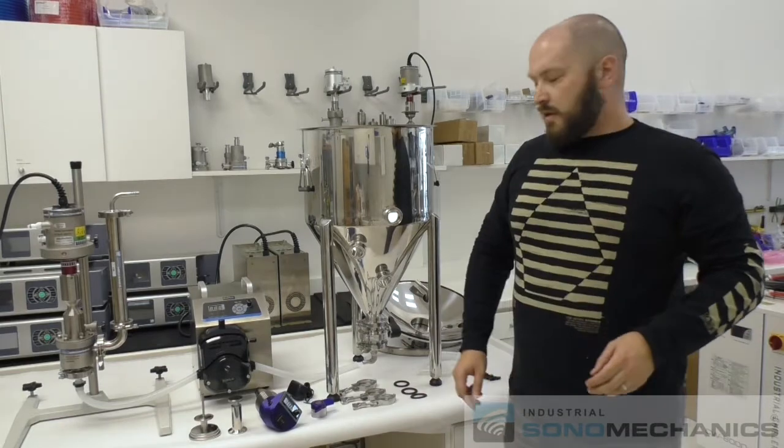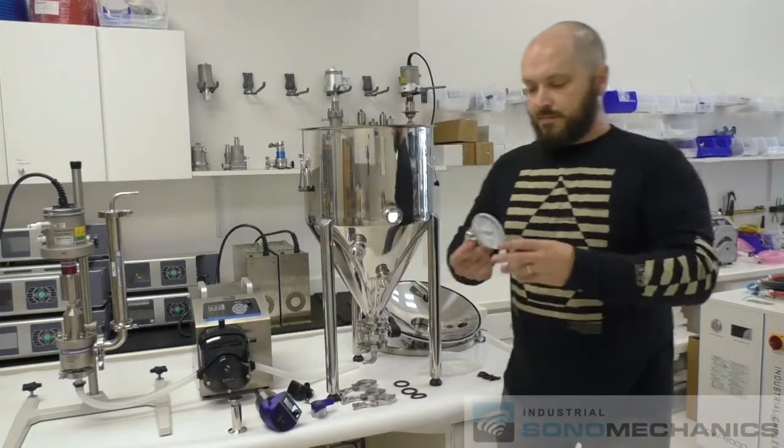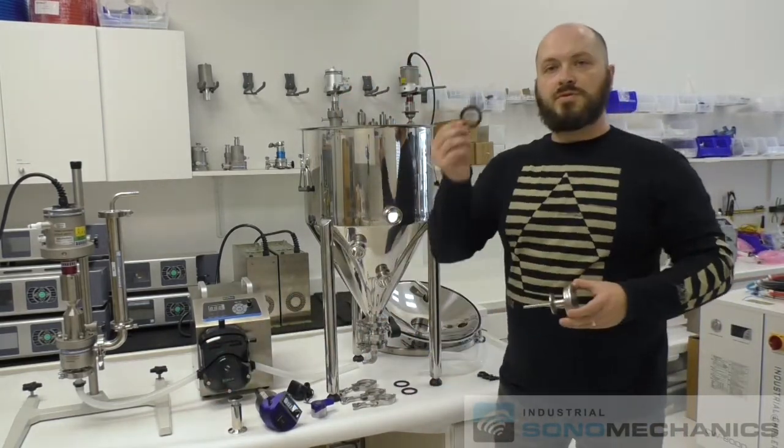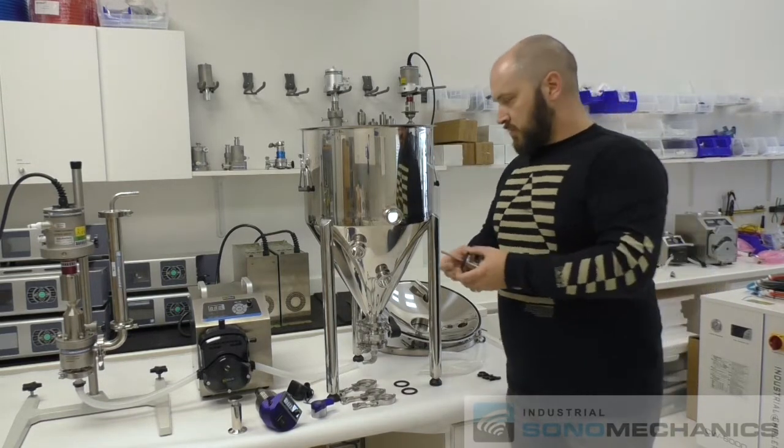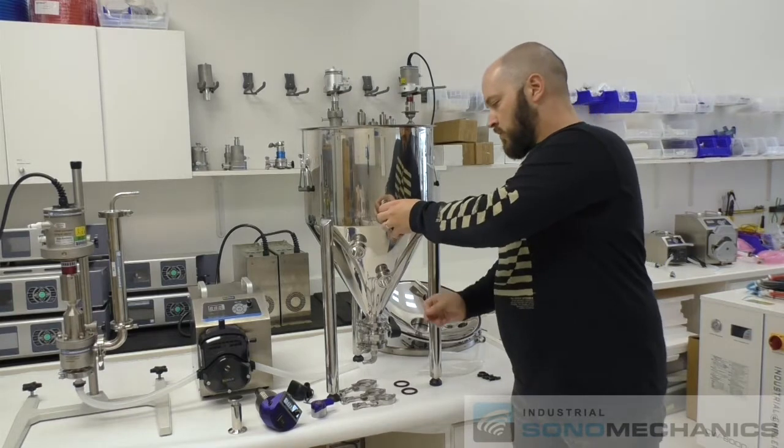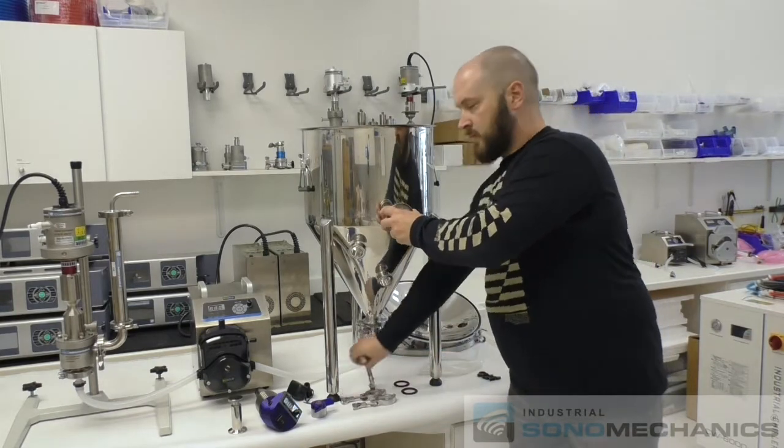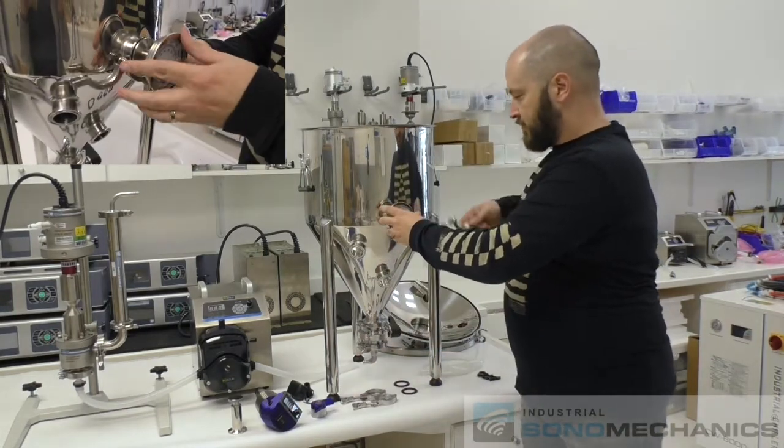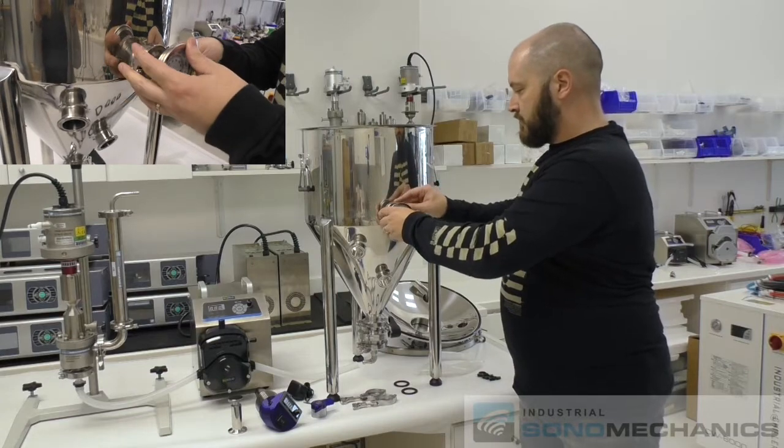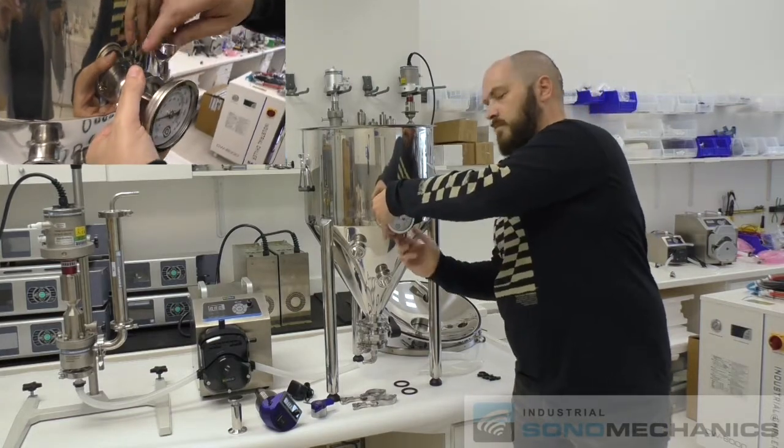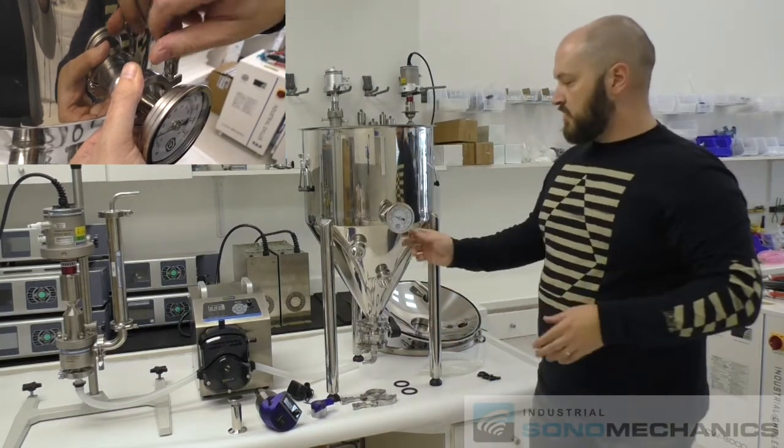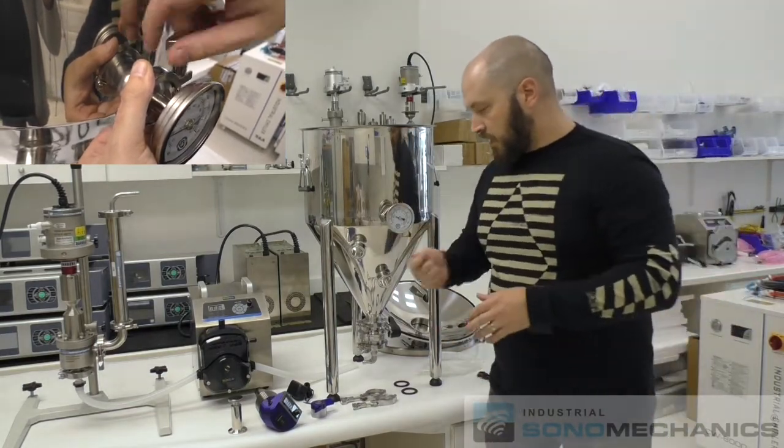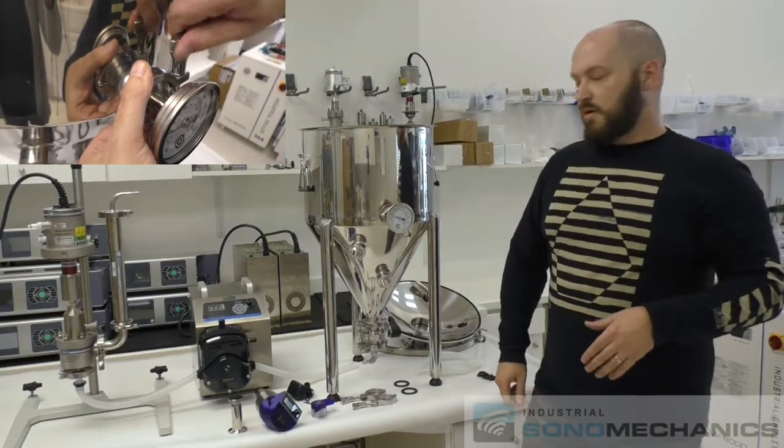So first we're going to assemble the analog thermometer. We always need to use sanitary gaskets when we're assembling these parts. So we'll align it here, grab a clamp, we tighten, and don't over tighten, just a few turns until you feel it's firm are enough.